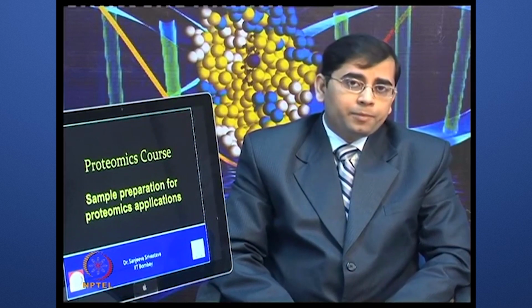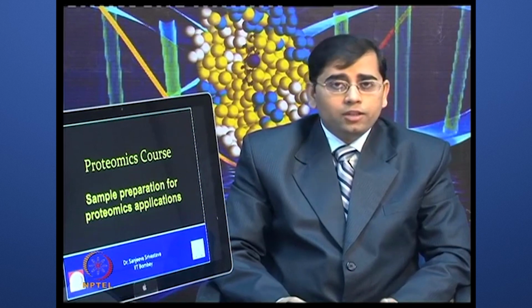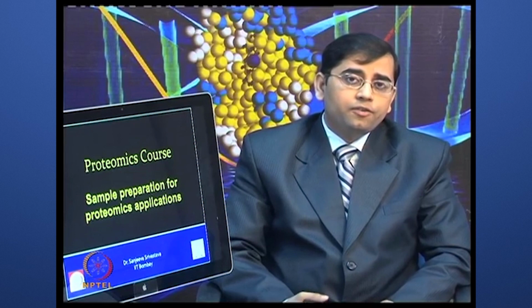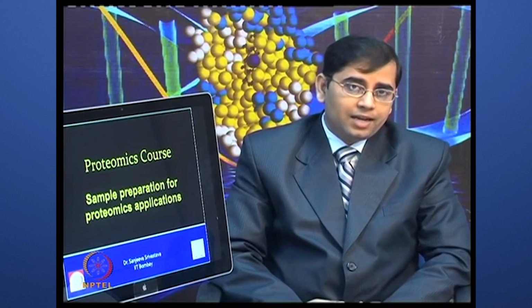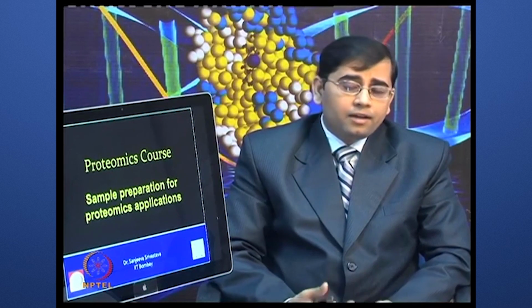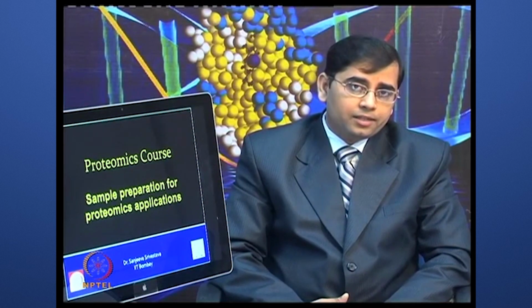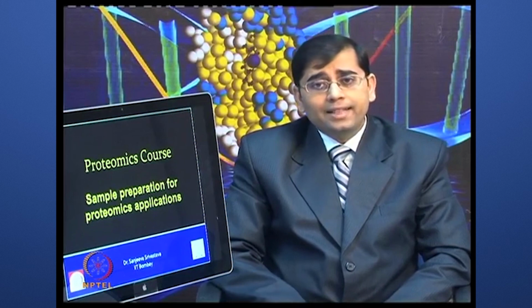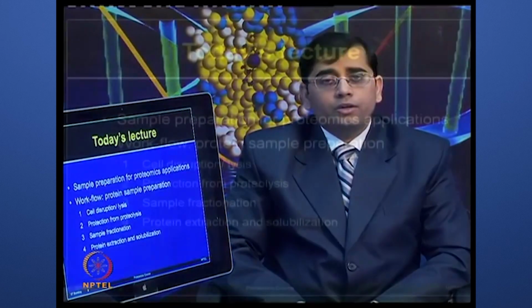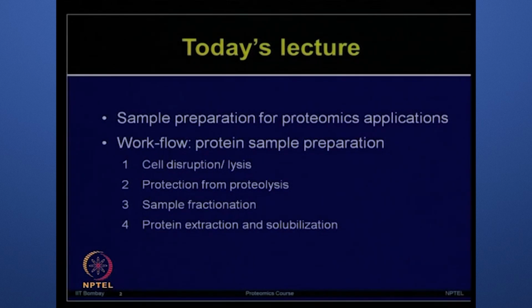An ideal sample preparation will ensure that you have all the proteins present in your sample without different types of contaminants such as nucleic acids, salts and other interfering components. In today's lecture, we will talk about the sample preparation for proteomics application.